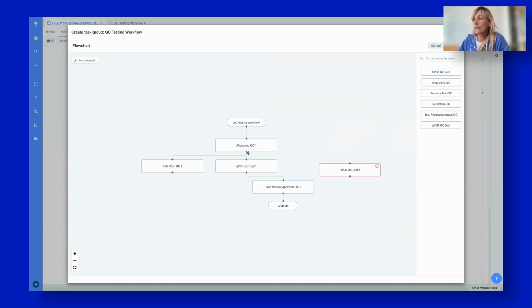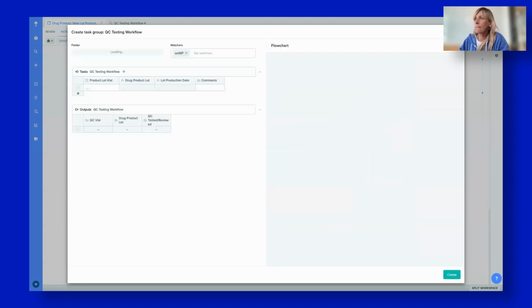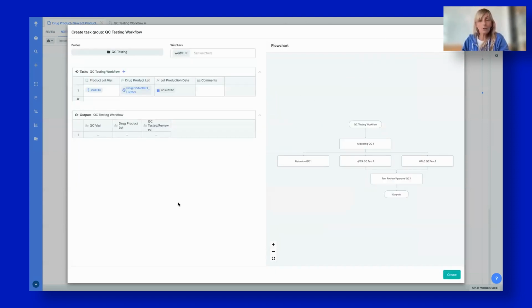All I have to do is drag this test from the available tests, connect inputs and outputs, and here I have my new workflow defined for the QC team to process. So as you can see, Benchling can support both scenarios: the scenario in which the workflow is structured and defined, but also the flexibility for those teams that need it, maybe to test different processes.